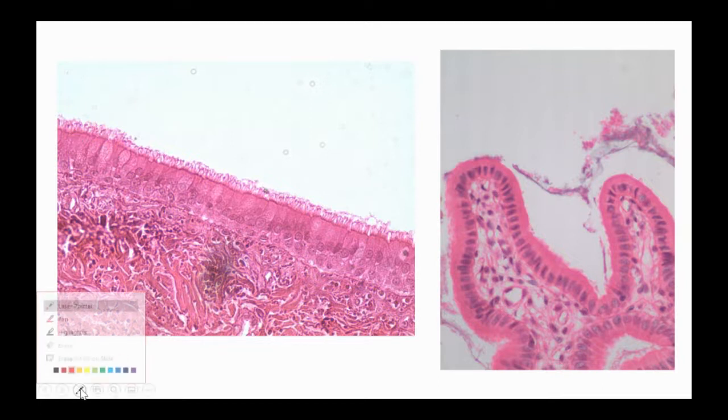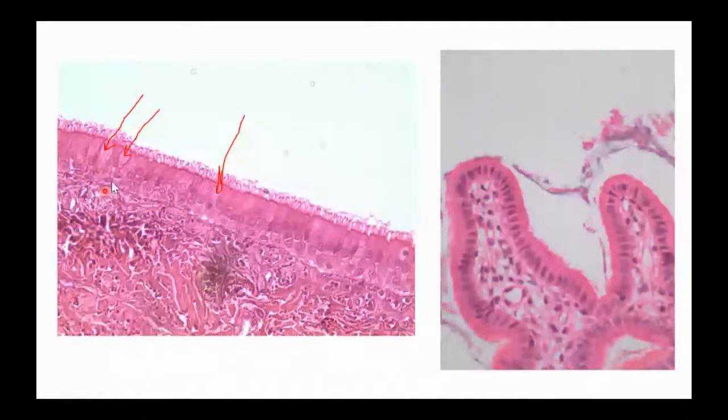I'll mention something too. Get out my pen. See this little thing right here and right here, right here. Okay, what you're seeing mixed in with this tissue here are a type of cells. You'll find information about this at the end of the lesson 4 packet. These things that I pointed to here, they're called goblet cells. Goblet cells are things that make mucus.